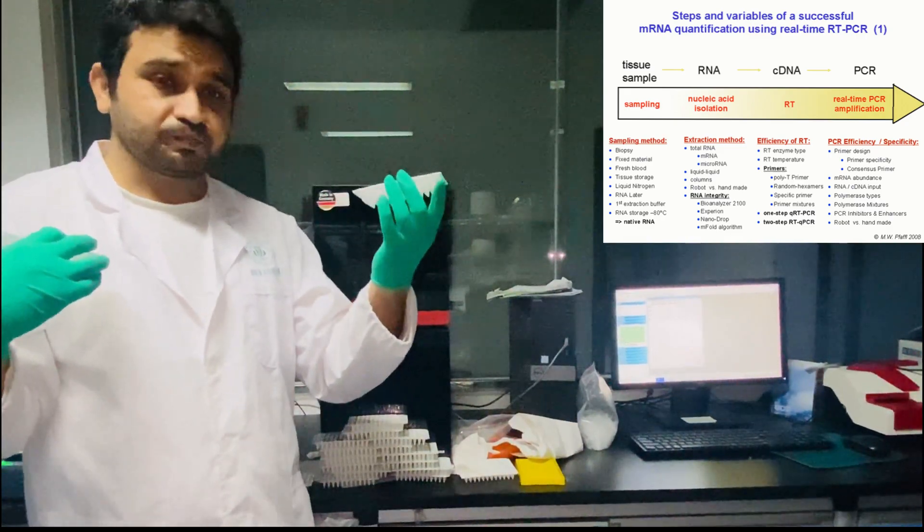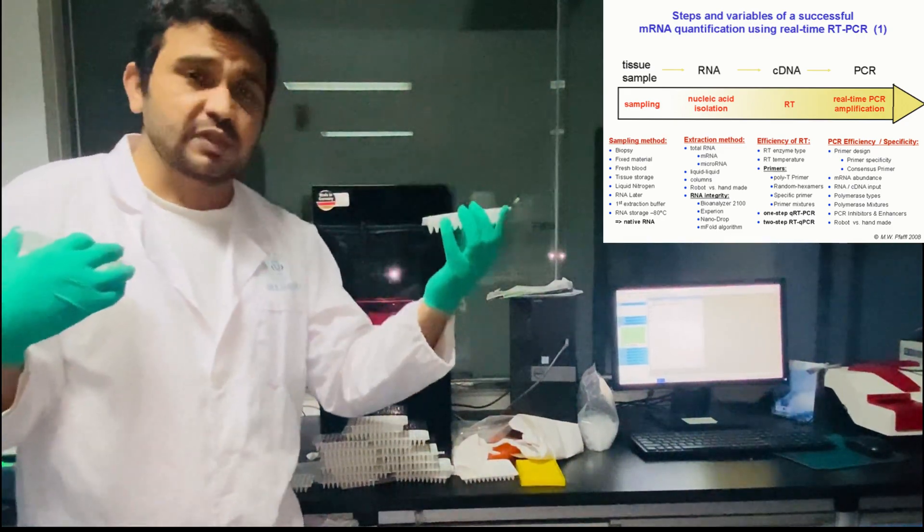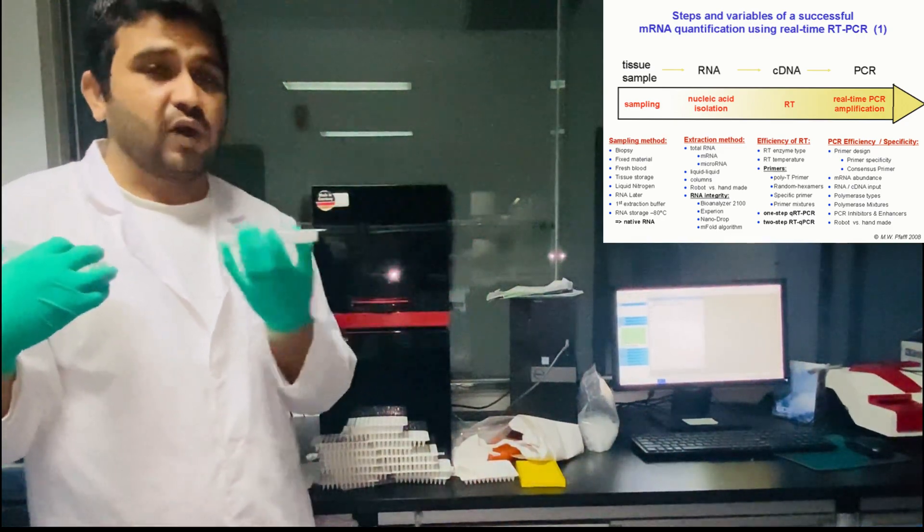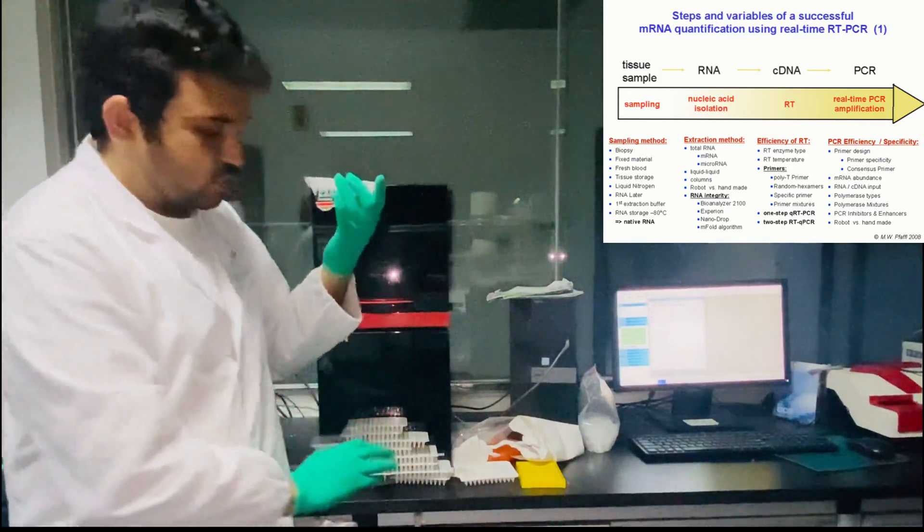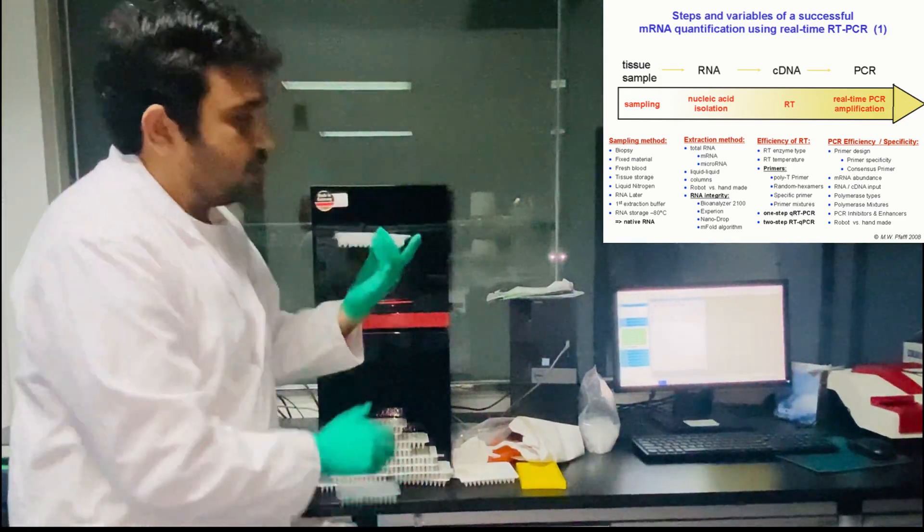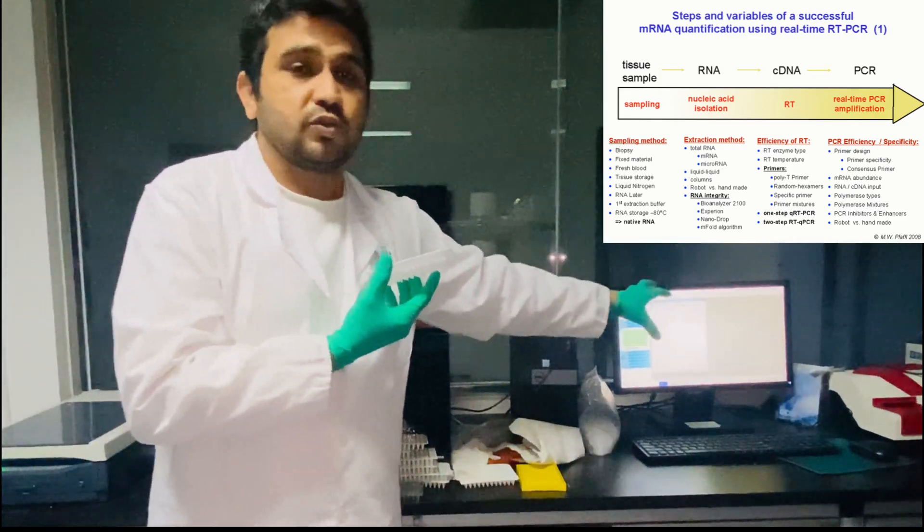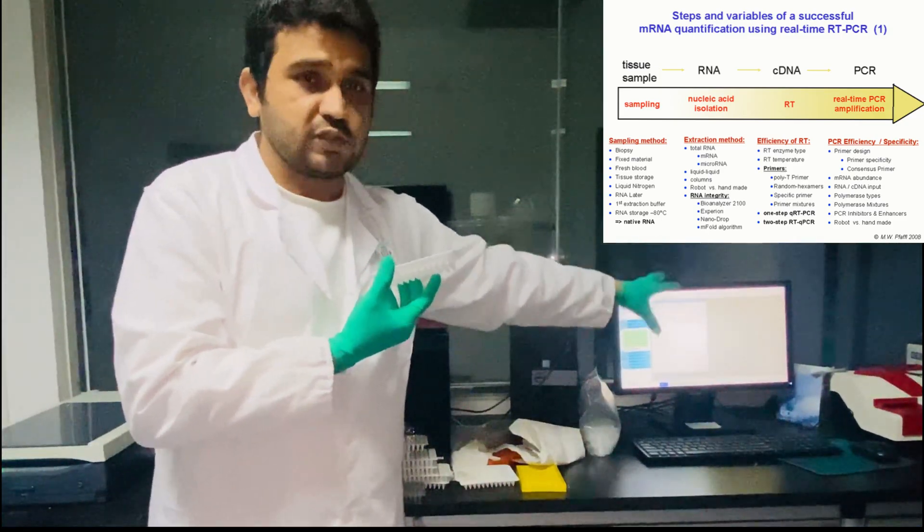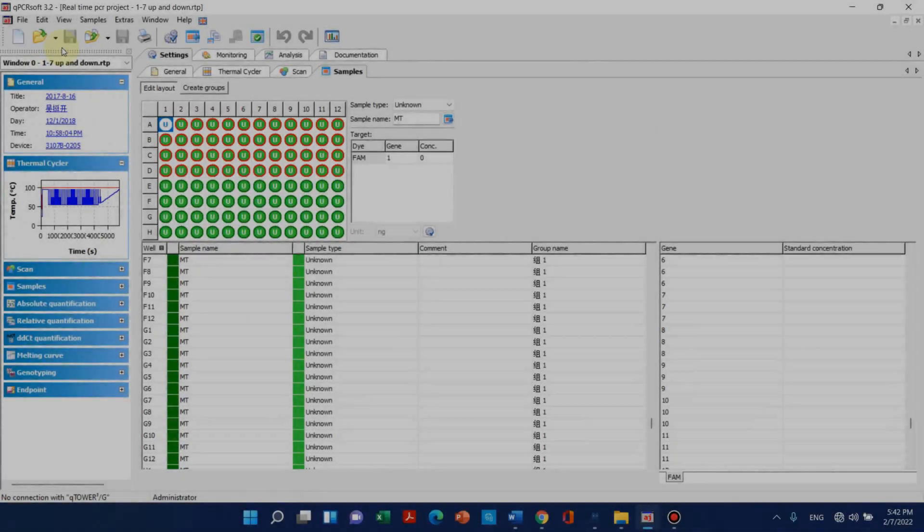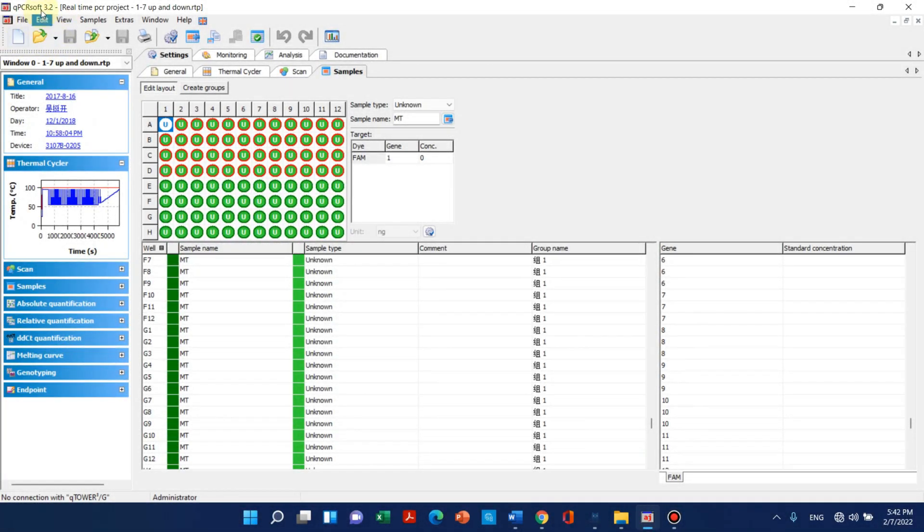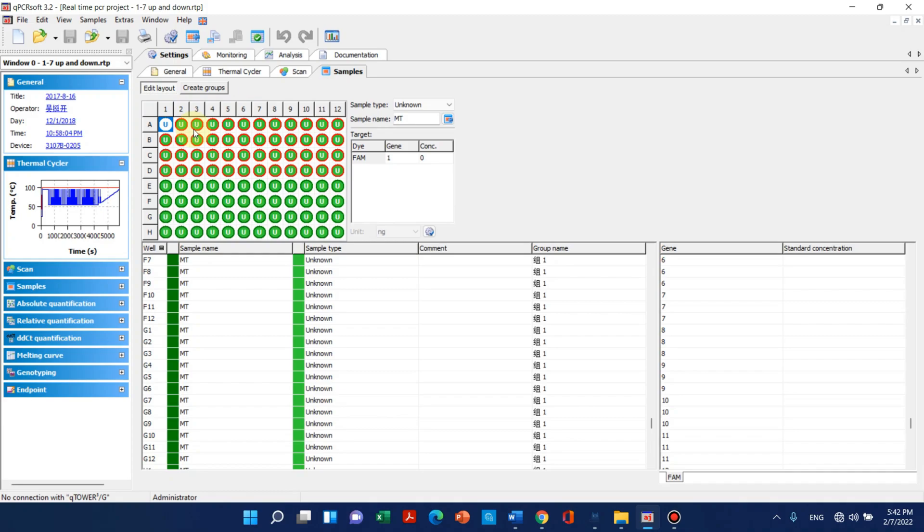Now I will take you to the computer screen and I will show you how it actually works. Here is the software which is attached with qPCR. This is the 96-well plate layout and we can name them according to our choice.